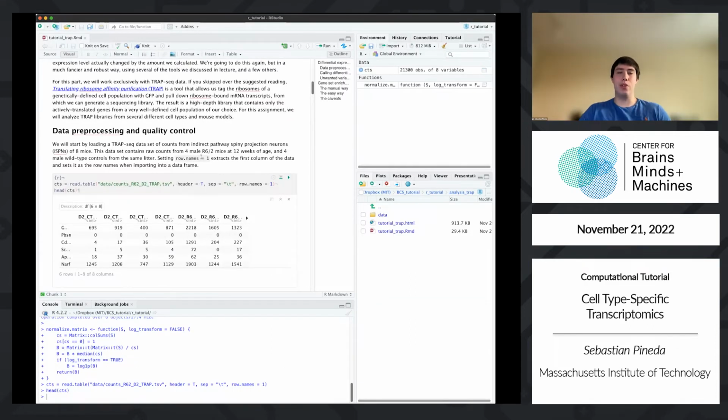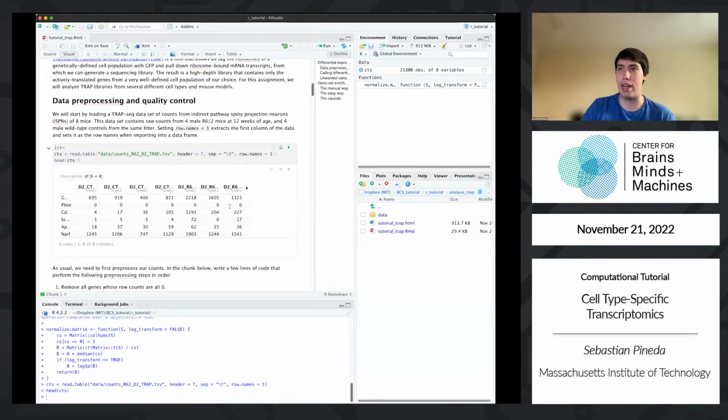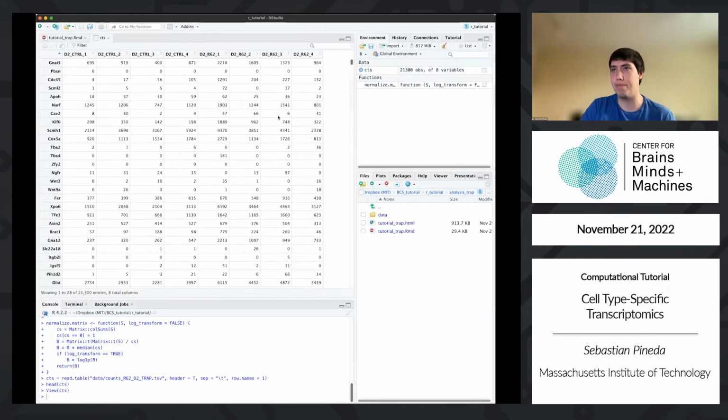As I mentioned, once we do all the alignment, all the quantification, all the QC, which most people don't have to do themselves. If you send out a sample to be sequenced, they'll just give you this part because it's very straightforward. Or when you buy a kit, they might recommend some tool that'll do all this for you. And basically what you're going to be handed, in the case of trap data or any RNA-seq data, because ultimately the trap data looks like any other RNA-seq data, is a matrix of counts that looks like this.